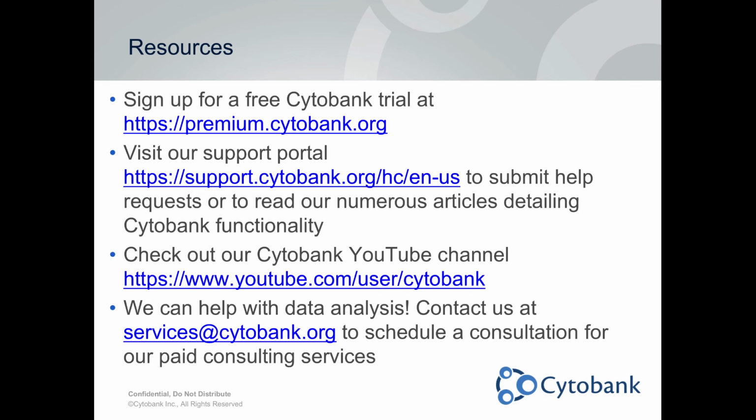Yeah, so maybe just an additional comment. It sounds like essentially you have to determine this combinatorial data analysis approach like you discussed, Shahram, and there are various tools to do it, and some of these tools are found in Cytobank. So in the example I gave earlier, that was one data analysis pipeline that you could use using Cytobank tools, and then Shahram and Richard talked about a data analysis pipeline that they use to remove some of these biases in their studies. So this is a good follow-up question maybe to that for Shahram.